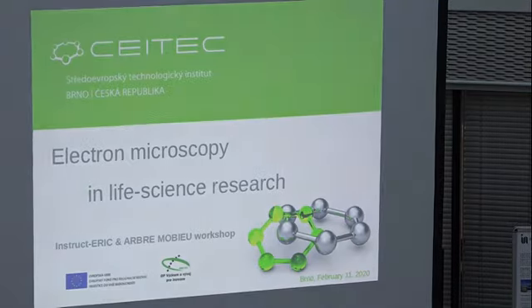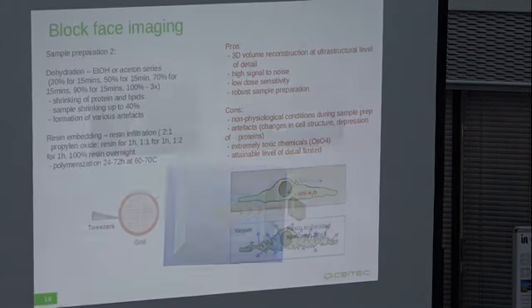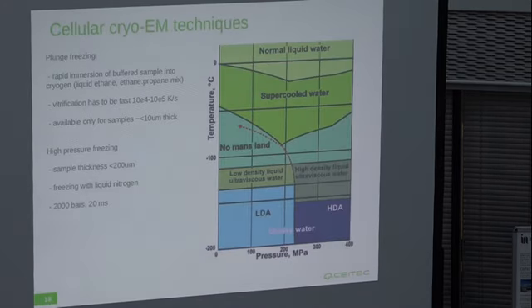Okay, let's quickly go further. All right. So then the last part shall focus on the cryo techniques.